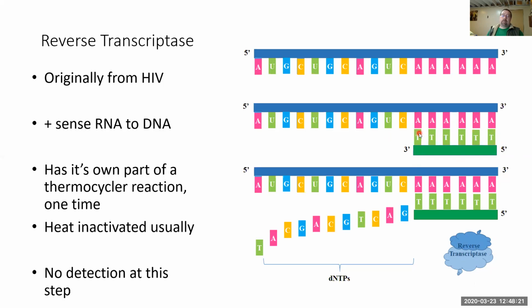I'm going to get back to this as well, but the CDC sent out a small test kit, and it shows basically like 4 primer tubes. One set of primers is specifically for the reverse transcriptase part. So that will bind to your specific RNA of the COVID virus. That only will be amplified, and then you'll have less background that you're having to worry about.